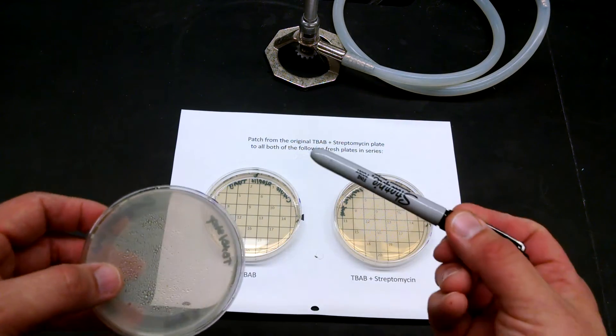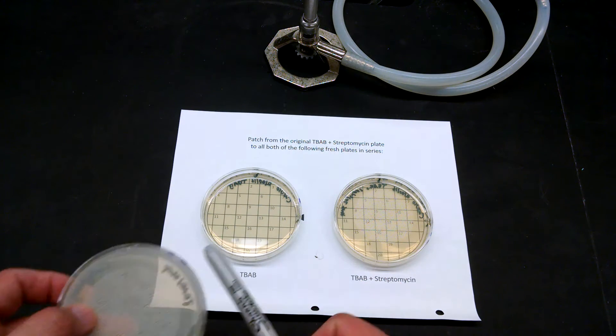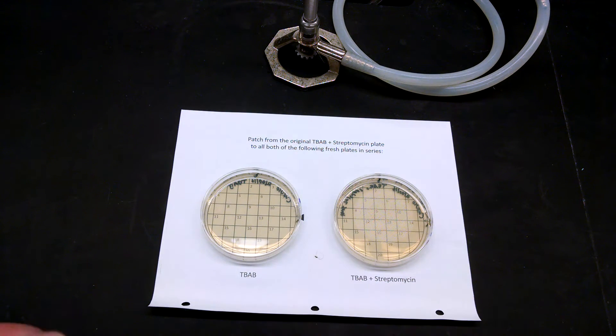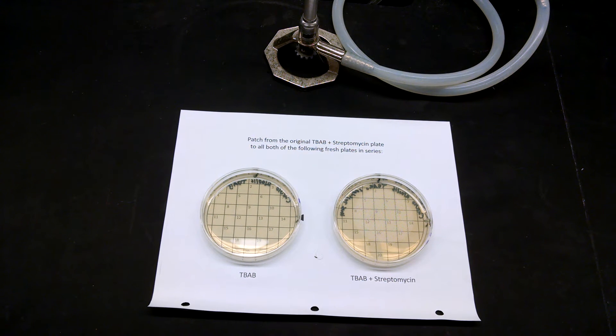And so here's how we're going to do it. What we're going to do is we're going to take a toothpick, touch a colony, and if you look through the plates, what you will see is... Let's see if I can zoom in.